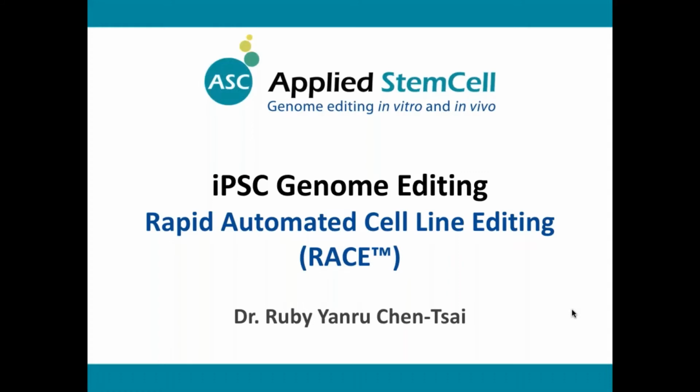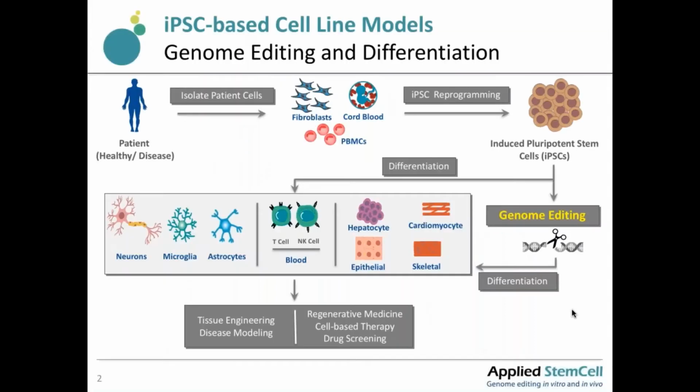This webinar is on iPSC genome editing, particularly on rapid automated cell line gene editing, or RACE. As you know, iPSC has a great potential for both research and therapeutic applications.